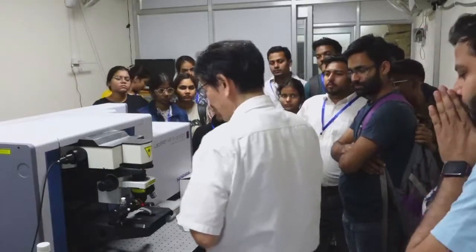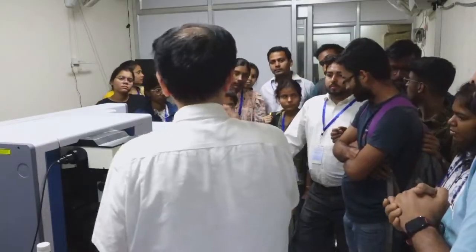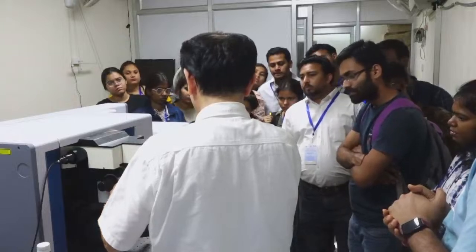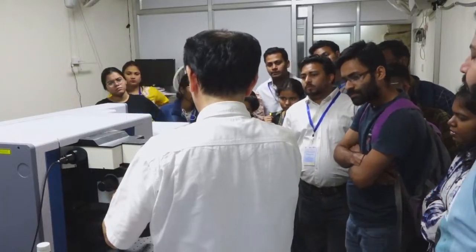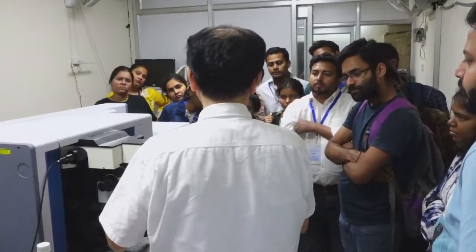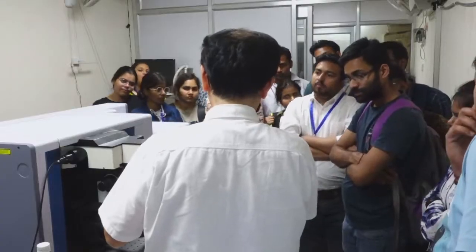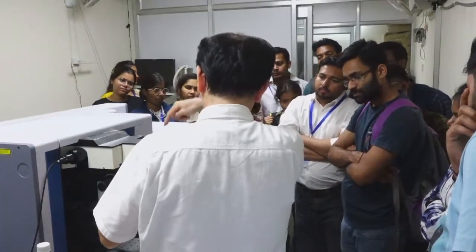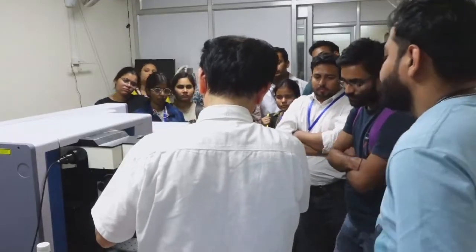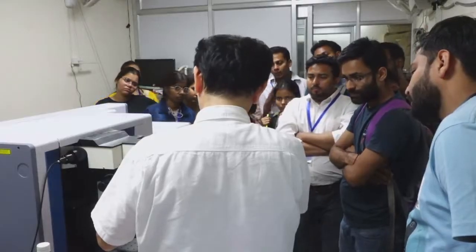And one more thing I explain this time is that in today's experiment, we use some attachment. So exactly speaking, today's measurement is not a Raman microscope measurement. You see, here is an attachment, and the laser beam comes from the top, and it is reflected by this mirror and passes through the focal lens.